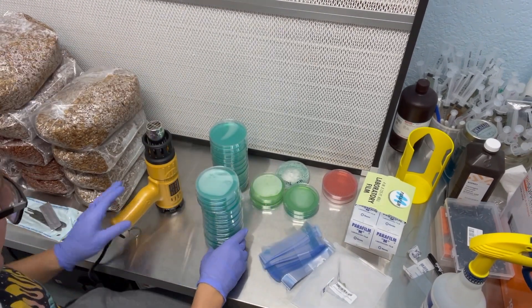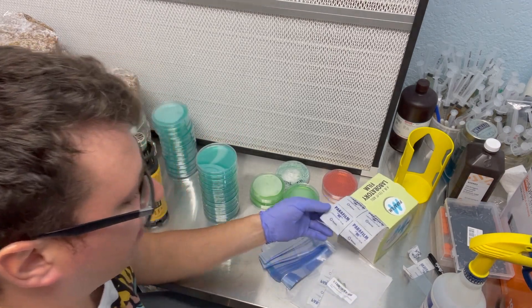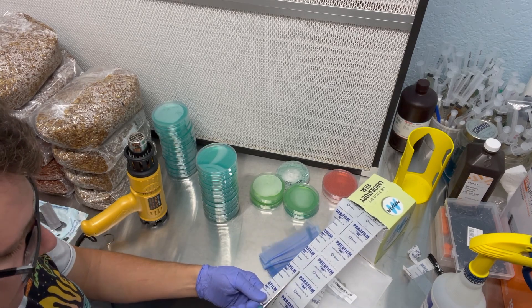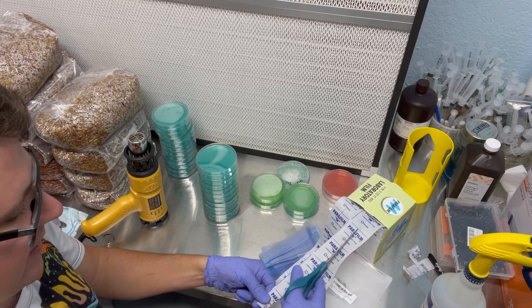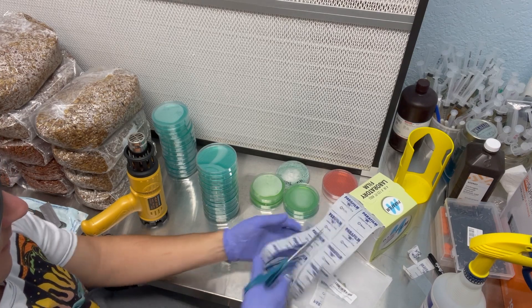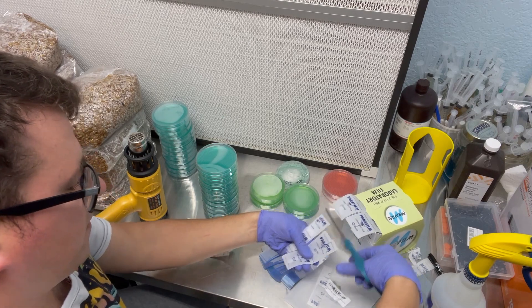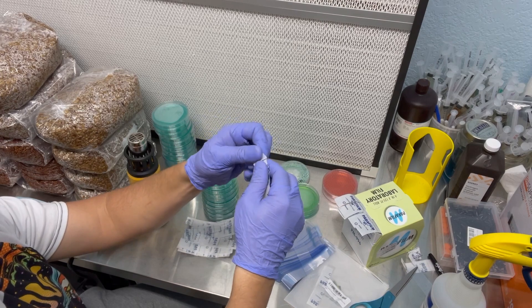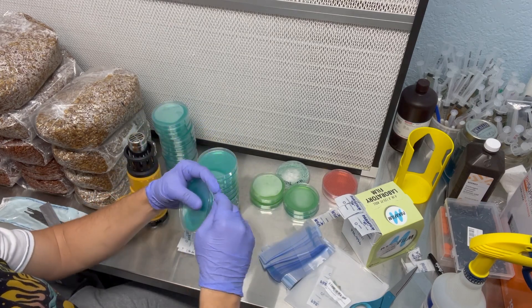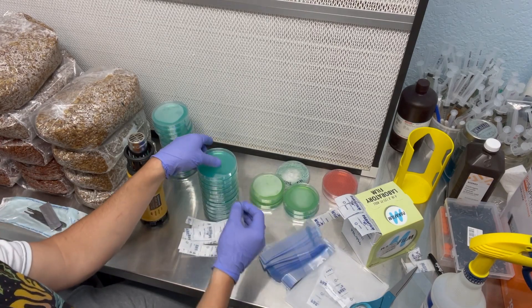That is the stack of shrink wrap plates, and now I'll do the parafilm. What I like to do is take my roll and cut it into strips of four. Then I'll make a little pilot rip to help me peel off the parafilm. One benefit I noticed right off the bat is that the parafilm actually has two waste products, whereas the shrink wrap kind of just shrinks on itself — that's a benefit for shrink wrap.